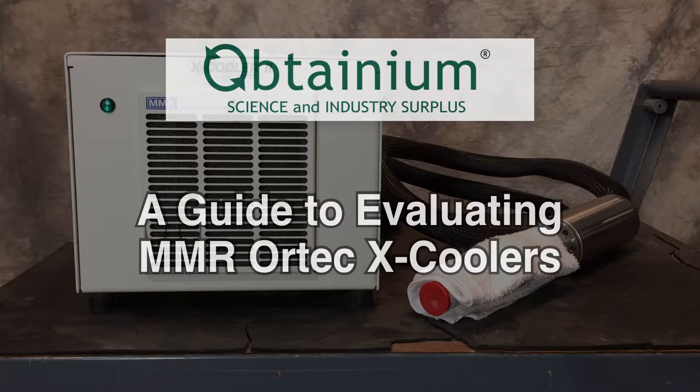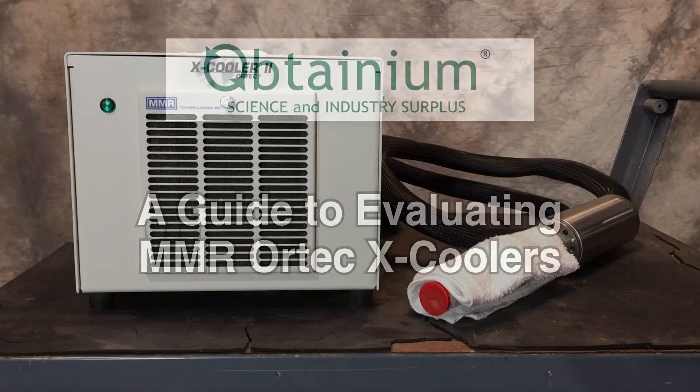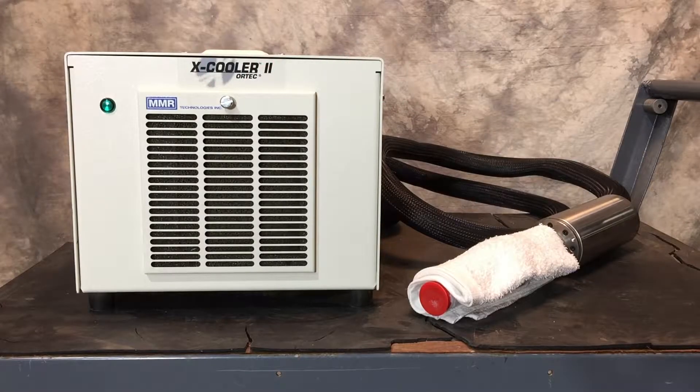Hello, John Schiff here again, and I want to share with you a procedure we use here at Obtainium to evaluate MMR Ortec X-Coolers. But first, let's quickly cover what an X-Cooler is and what it does.